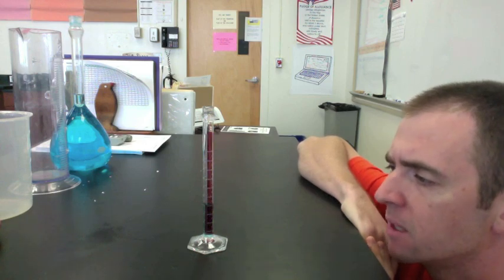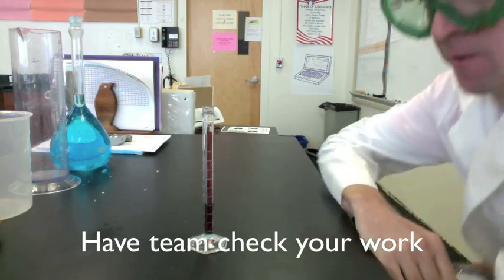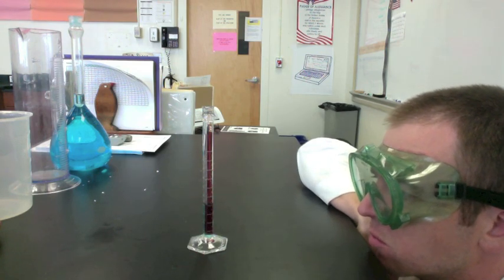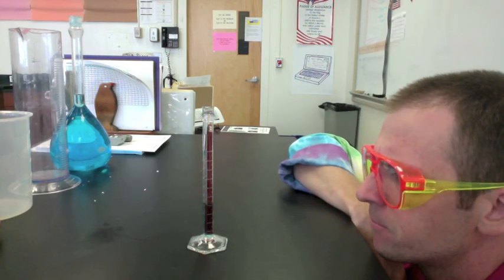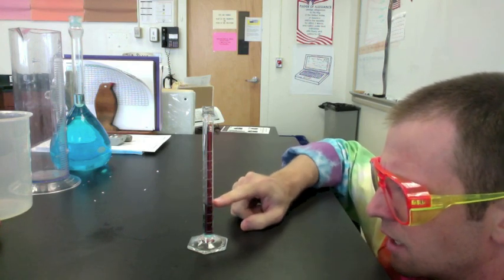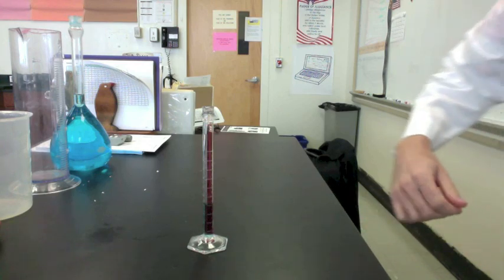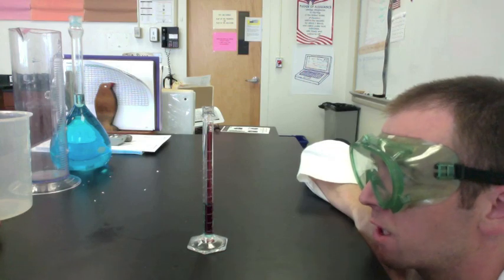4.1 milliliters. What do you think? Remember to have somebody check your work. Looks more like 4.2. Well, I think it's 4.1 — it's one line above 4, and each one's worth 0.1. Take a look one more time. You're right, 4.1. My mistake.